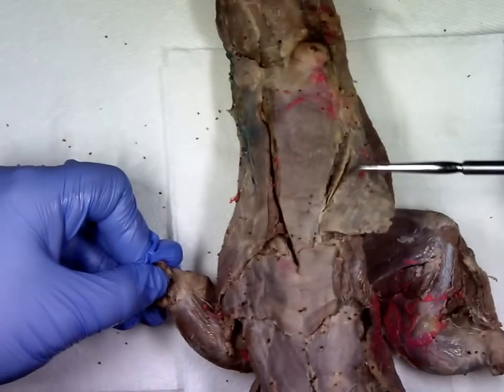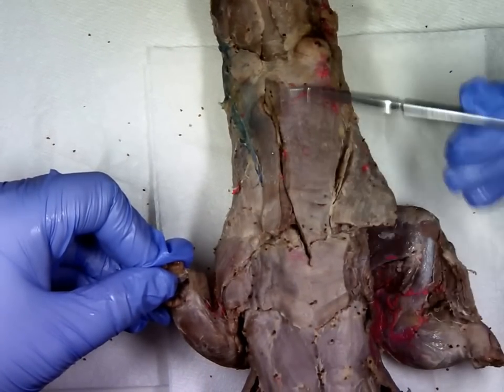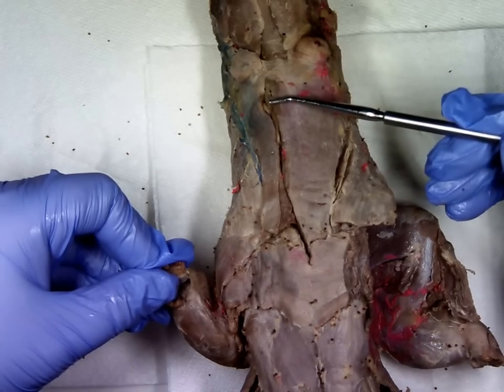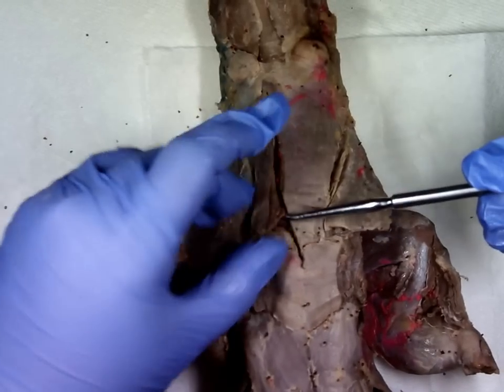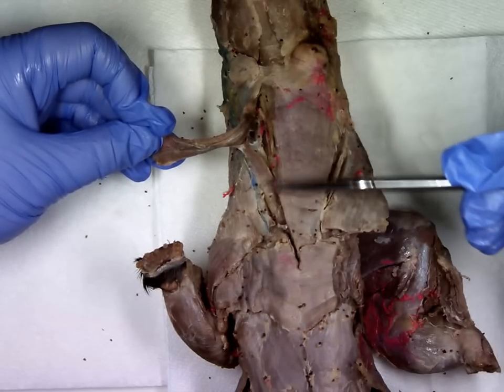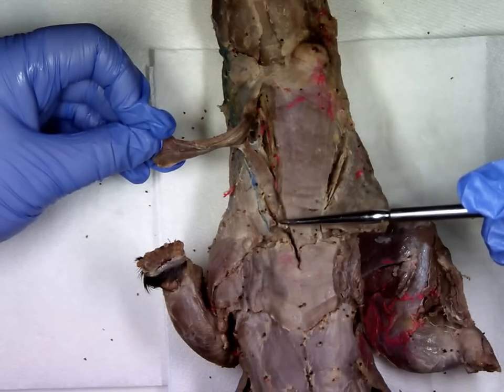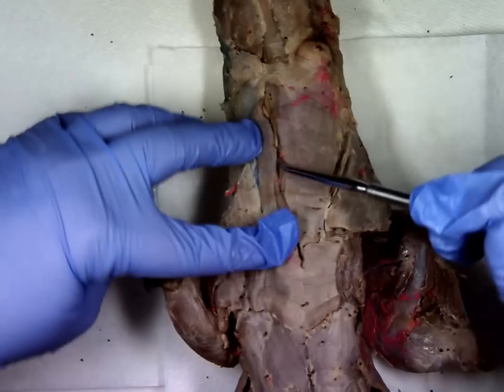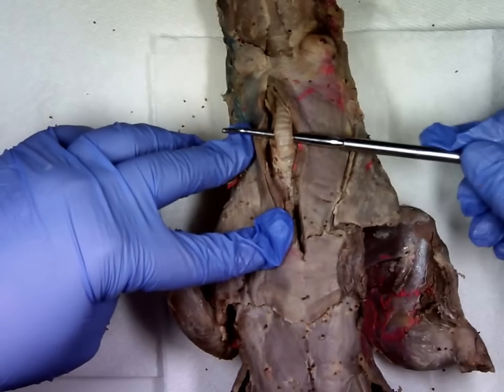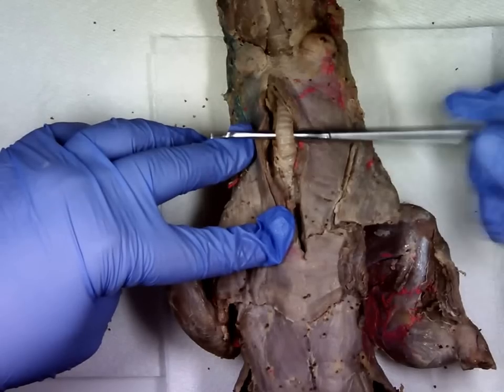Using your external jugular veins as landmarks again — here's one and here's the other on my mink — the muscle in between those is a large broad muscle called the sternomastoid. If we flip back part of the sternomastoid, we can see another muscle in muscle group one called the clavomastoid. Moving the sternomastoid aside, you can see this long rigid tube called the trachea.